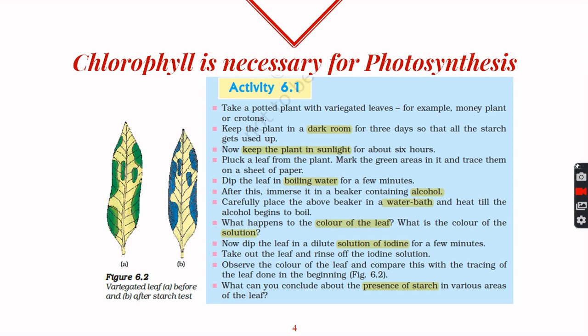After three days the plant is taken out and kept under sunlight for at least three hours. We will then pluck a leaf from this plant, trace it on paper, and mark all the green areas present inside this leaf. After that, we put the leaf in boiling water for a few minutes to remove the outer waxy layer, make the tissue soft, and also to kill the leaf.